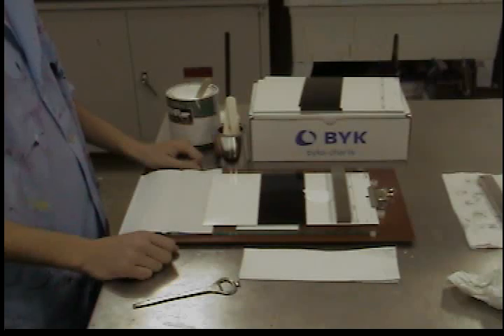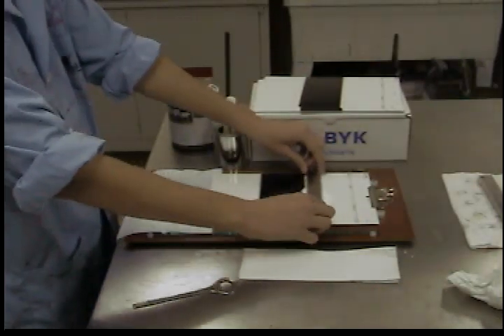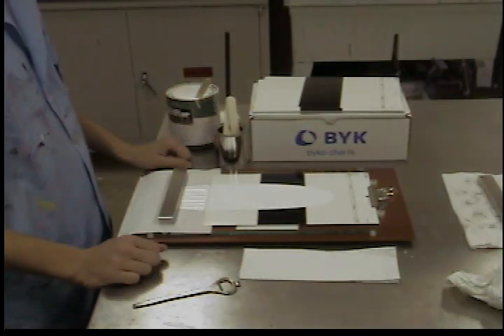Pull the two ends of the applicator towards the bottom of the chart at a slow, uniform speed. Continue to pull the applicator past the end of the chart so the excess paint collects on the paper towel.